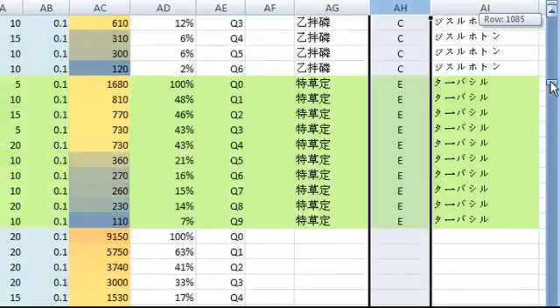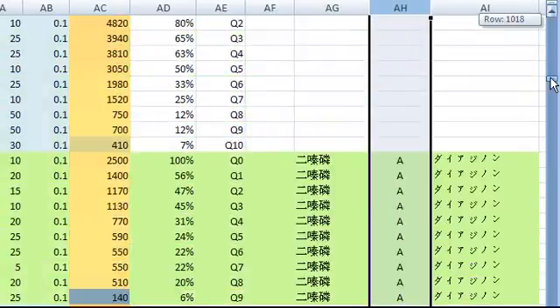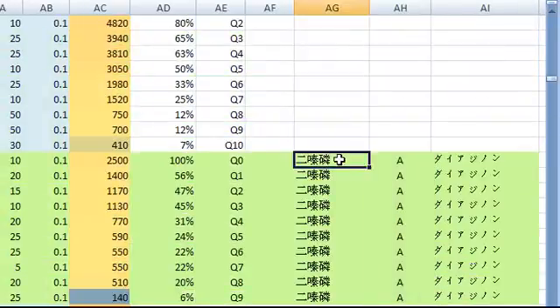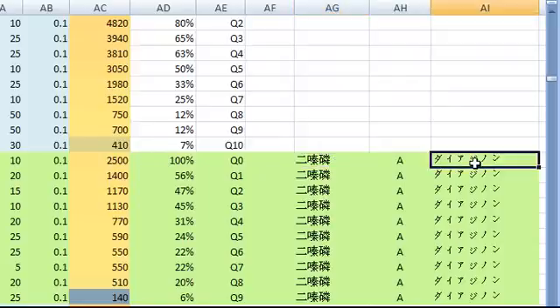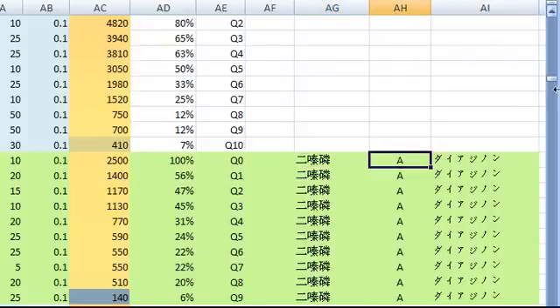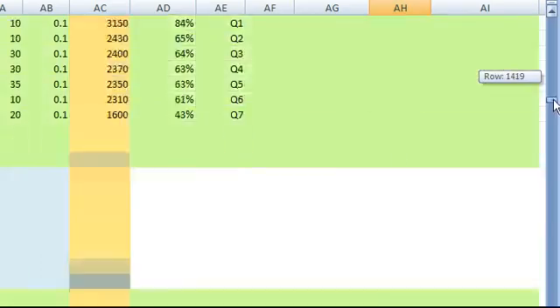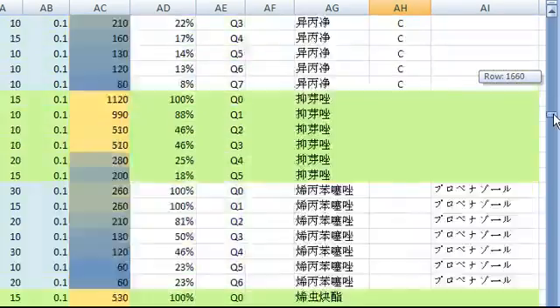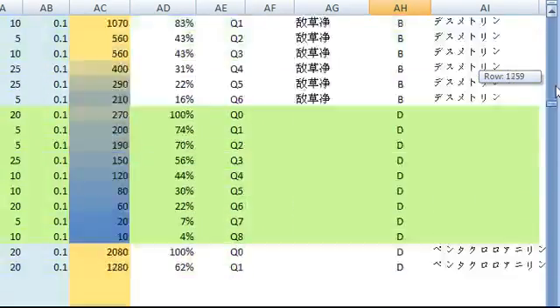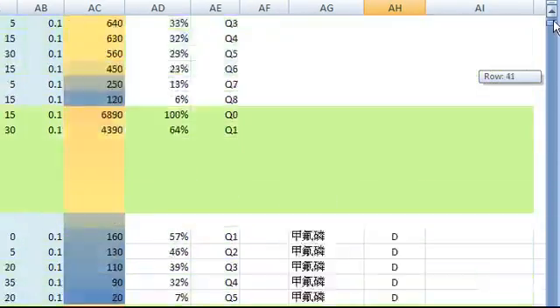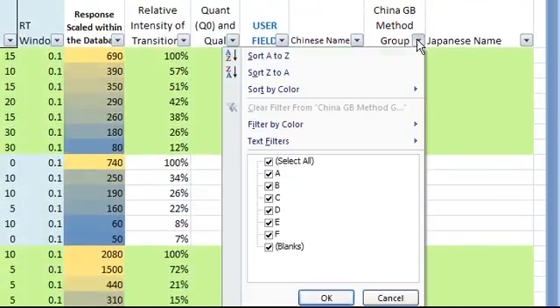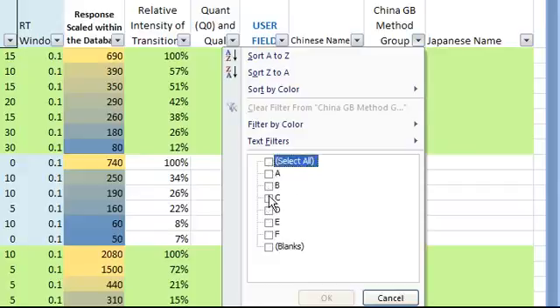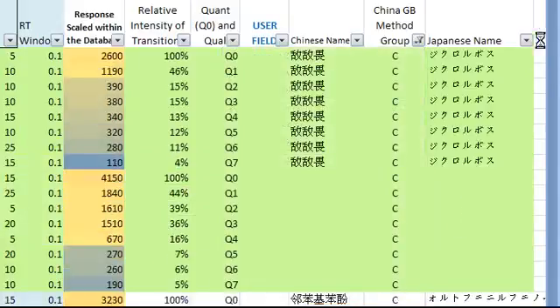When applicable, the database has Chinese name, Japanese name, and the group number of the Chinese national method for each compound. We can use the filtering function to select, for example, only group C compounds. The database can quickly filter it out for you. You can then build an acquisition method for just group C compounds.